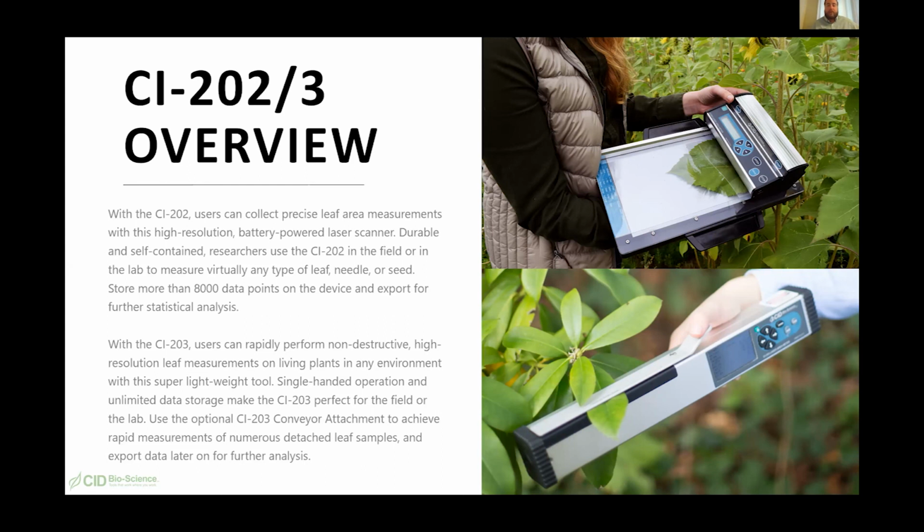The next question is, what is the life of this instrument? I would say the life is mostly determined by your care of the instrument and how much abuse, I guess you could say, you put the instrument through. As long as you aren't consistently dropping it and leaving it out in the rain and things like that, and you send it in for maintenance when you need to, then you can make this instrument last as long as you need it to work. So I would say the life of the instrument is almost completely dependent on the user.